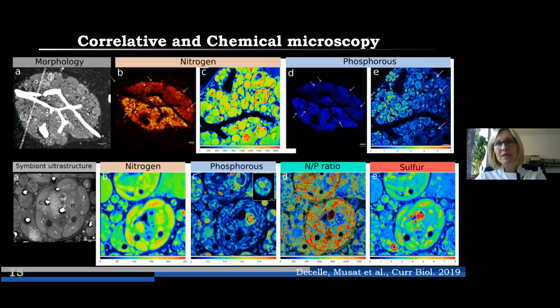Our purpose here was to look at native elemental, isotopic, and molecular mapping, and to understand how this symbiotic algae behaves within the host and as free living.